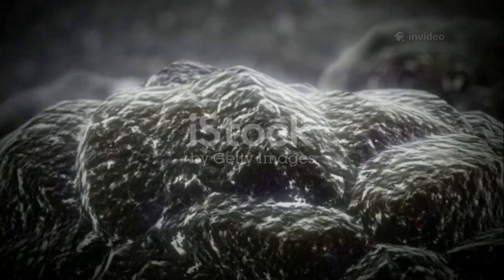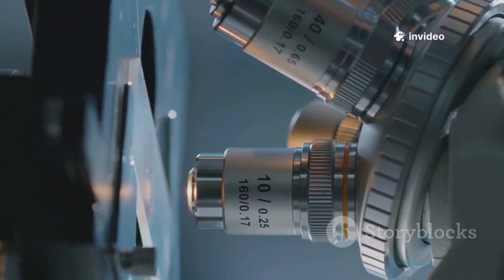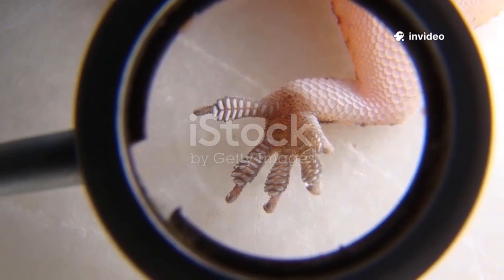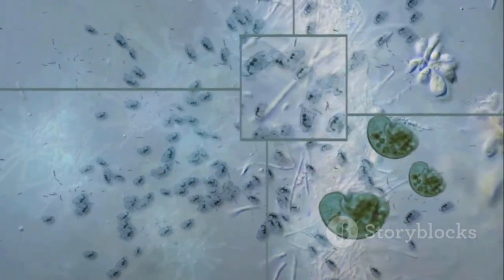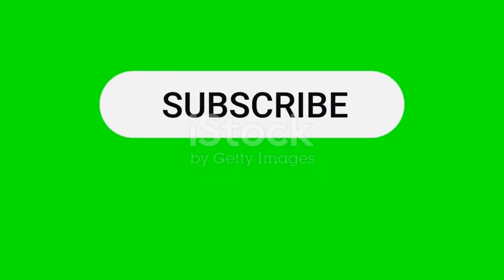The result? You get jaw-dropping surface detail, like seeing every hair on a fly's leg or the ridges of a silicon chip. And the best part, SEM images can magnify up to hundreds of thousands of times. That's like zooming in so close you could spot a fingerprint on an ant's foot. So the next time you spot one of those epic microscopic images online, just remember, it's not magic, it's science, and it's totally electrifying.